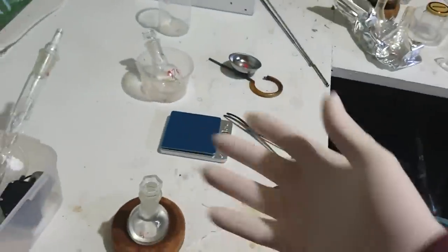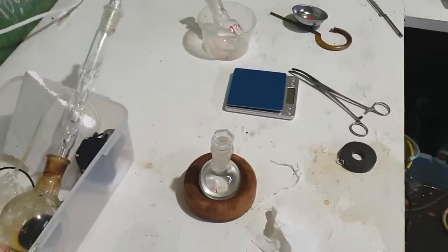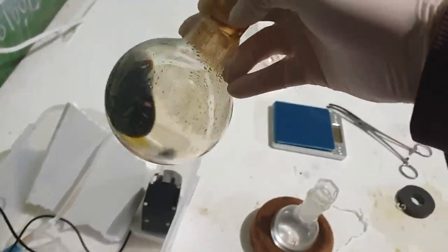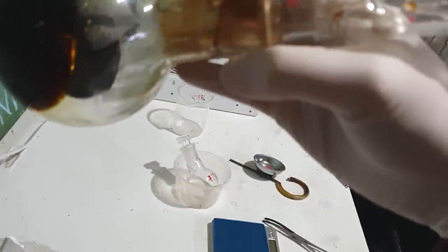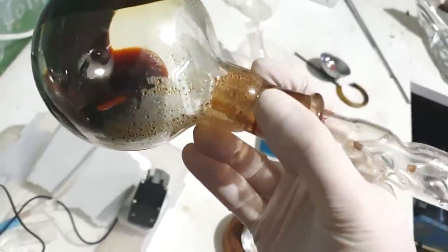So we get to calculate our yield now, and there were a lot of people putting bets on for how much our percentage yield was, and thank you for all the comments. I feel really bad because no one was correct, because I didn't let you guess 0%. This is just our solvent. This is our reaction pot, and it looks exactly how a lot of you suspected it would look, which is what we call tar. Look at that. That's absolutely fucked.